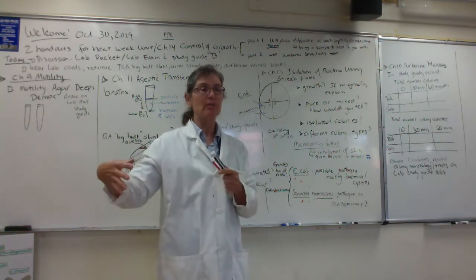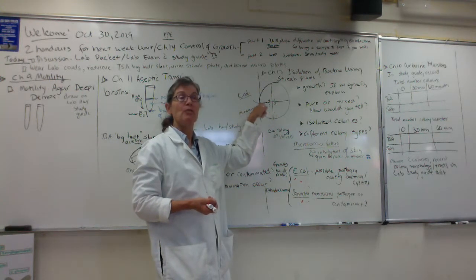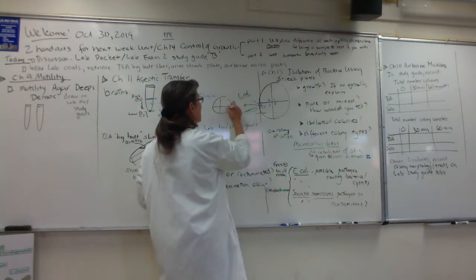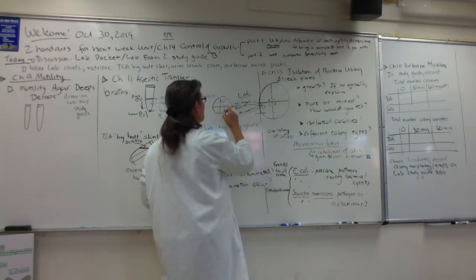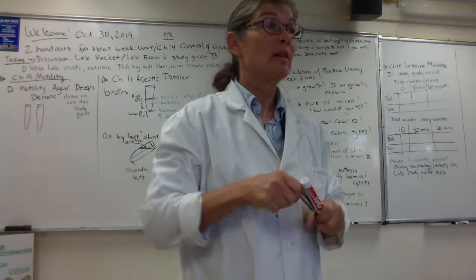So you're going to get another plate, right? And using aseptic technique, you're going to transfer cells from the E. coli colony to a brand new plate. We call that a restreak, right? So you get a brand new plate, and you're going to restreak cells from the E. coli colony to your new plate, right? Incubate. And then in 24 hours, you should have a streak plate that only has E. coli growing on it. Now, why is that a big deal?